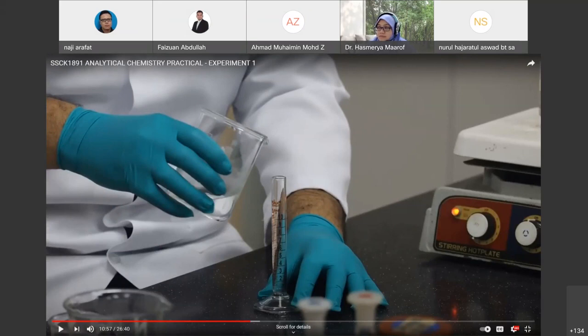Any answer? Anybody want to try? Optimum temperature, what does it mean? Can it perform at a lower temperature, say for example 60 degrees Celsius? Can we perform it at that temperature? Okay, but can we perform at 60 degrees Celsius? So the answer is actually you can, right? The range of temperature for this kind of experiment is between 60 to 85 degrees Celsius, right? So 80 degrees Celsius is the optimum temperature.